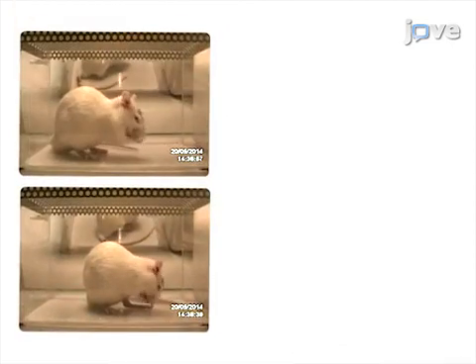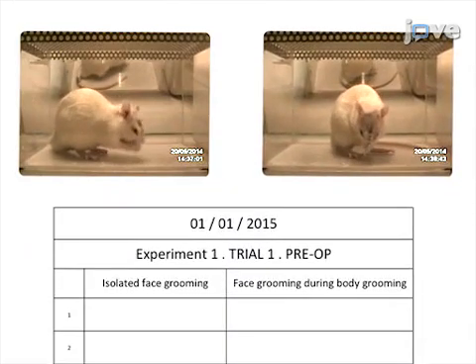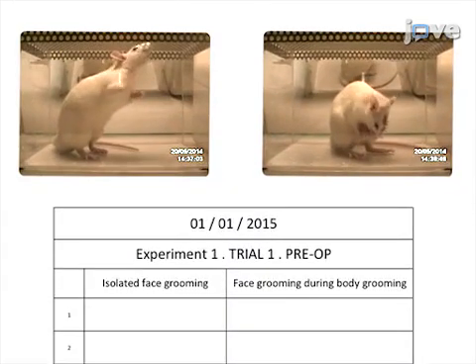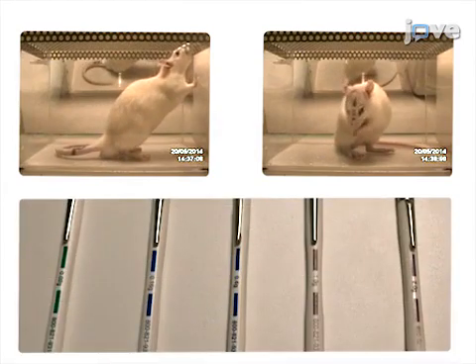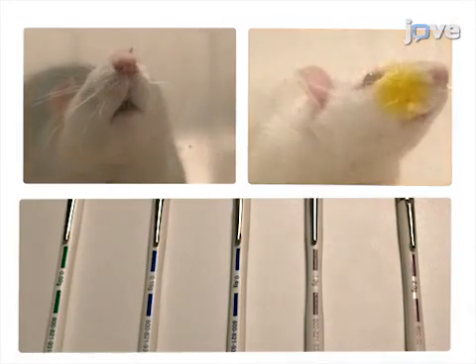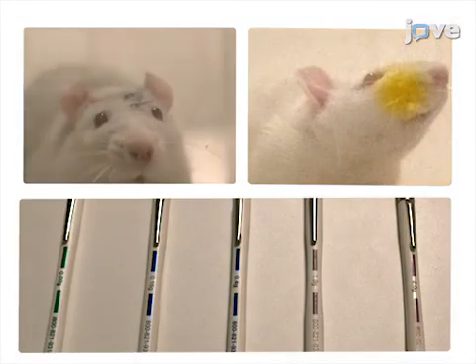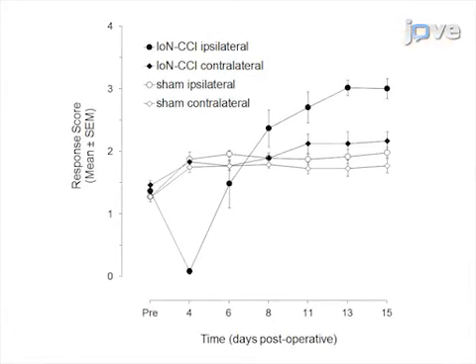Next, the animal is placed in an observation cage for 10 minutes and spontaneous neuropathic pain is assessed by measuring the amount of isolated face grooming. Additionally, mechanical allodynia is measured by stimulating the rat's infraorbital nerve territory with a graded series of von Frey hair filaments. Ultimately, changes in grooming behavior and response in the ipsilateral infraorbital nerve territory are used to investigate the treatment of trigeminal neuropathic pain.